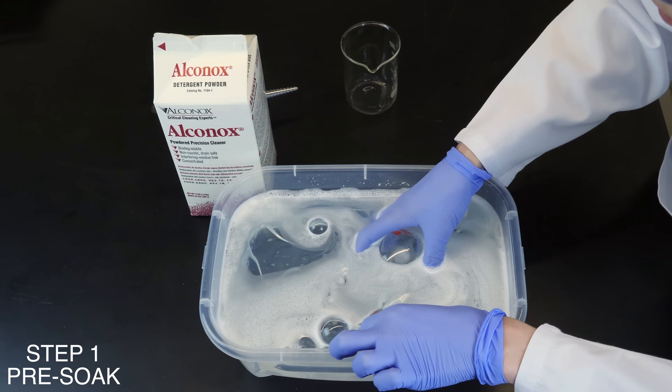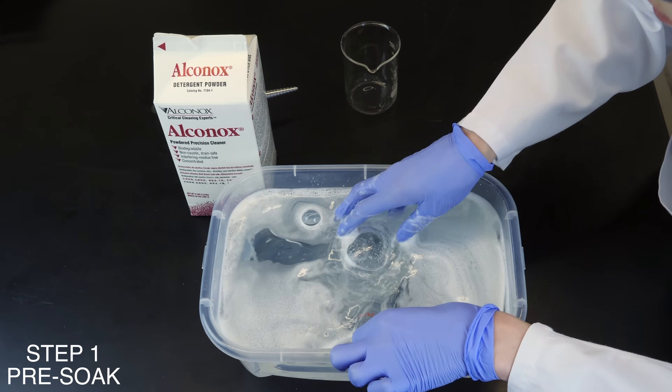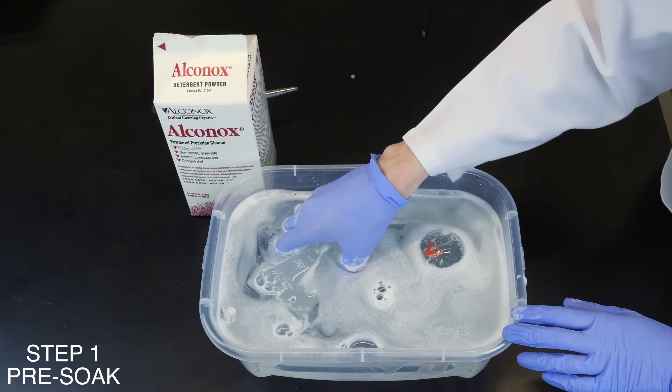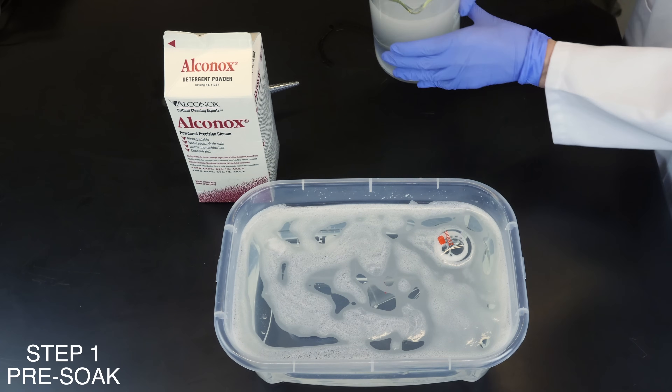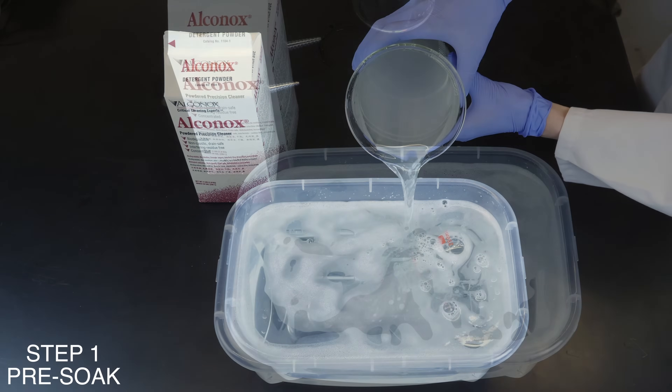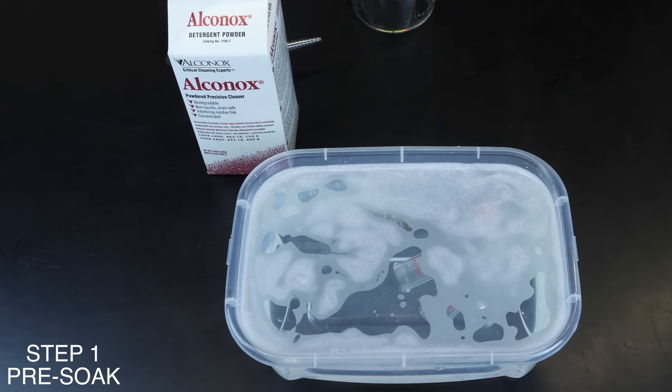Pre-soaking prevents residues from drying and hardening, which makes them more difficult to remove. Typically, you soak completely submerged in a roughly 1% Alkanox or Liquinox solution. Add water to assure complete immersion of the glassware, making sure to release air from the equipment for complete immersion.